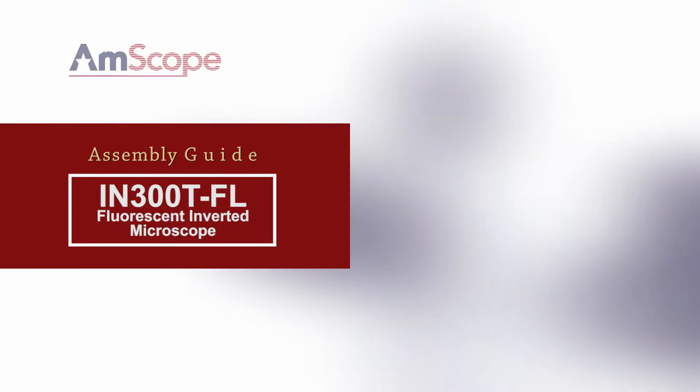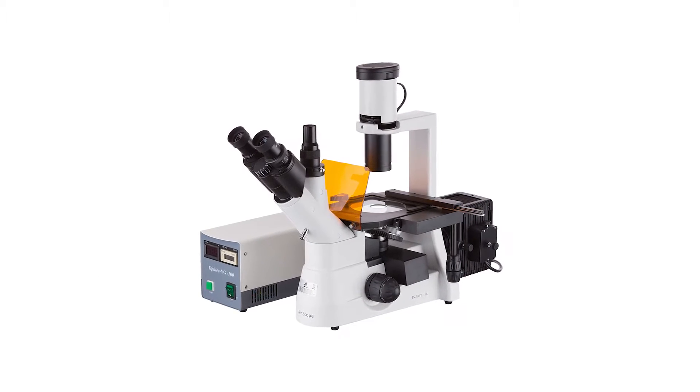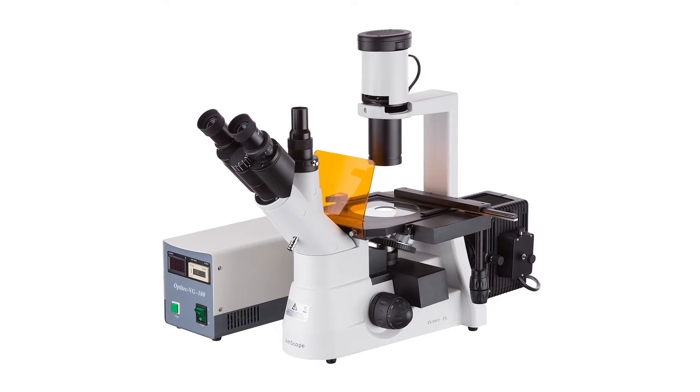This video focuses on assembling the IN300TFL microscope. The IN300TFL is an inverted compound microscope which features phase contrast and fluorescence excitation lighting.